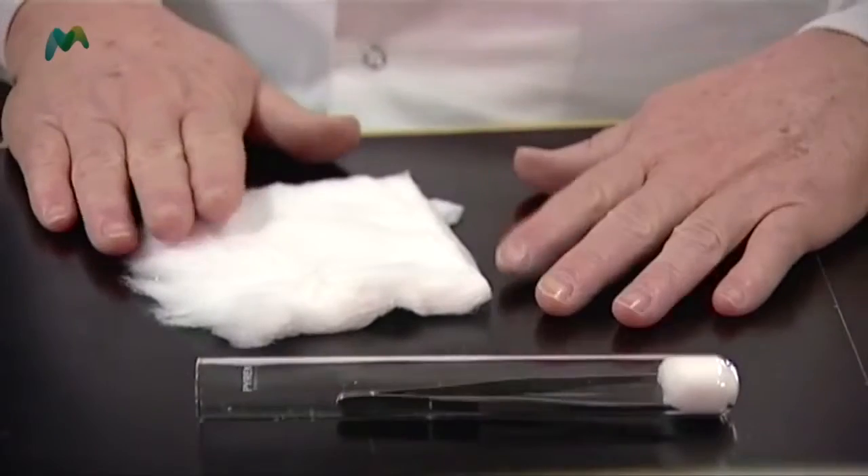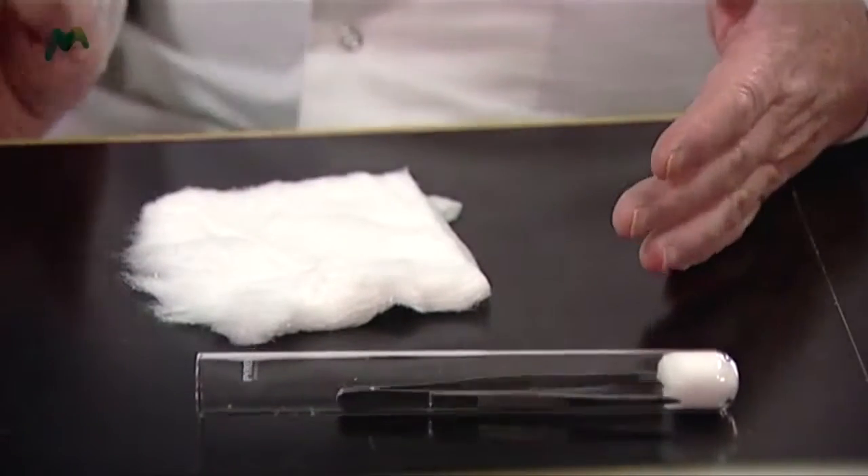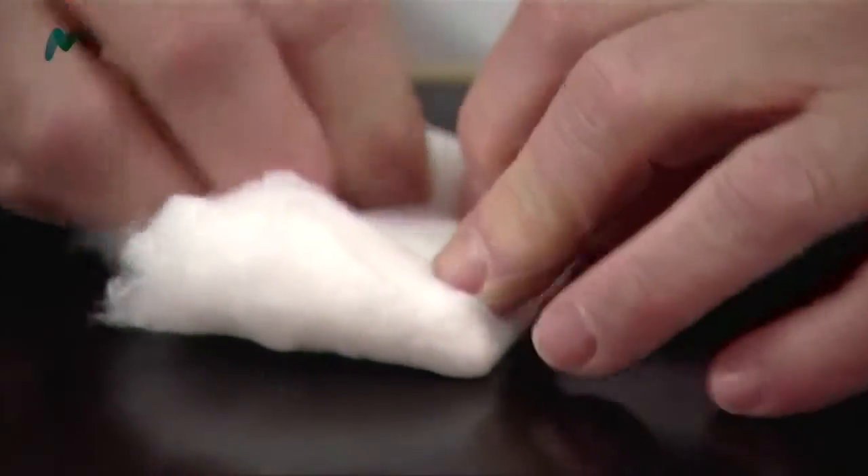We're also going to autoclave these, so what we need to do is to put a cotton wool plug in the top. What I've got here is a nice piece of cotton wool cut to more or less the right size. I need to fold it in half like that, and then I'm going to fold these edges in — that edge in, that edge in.